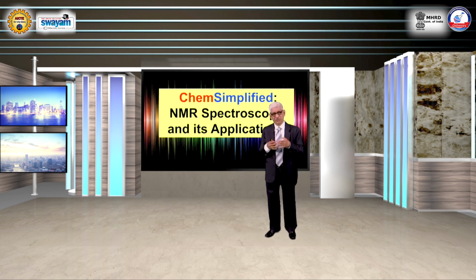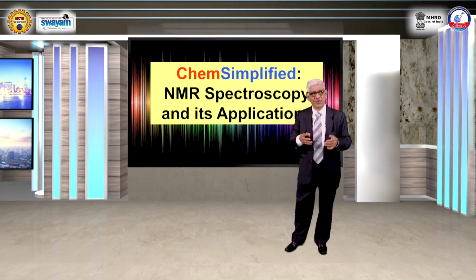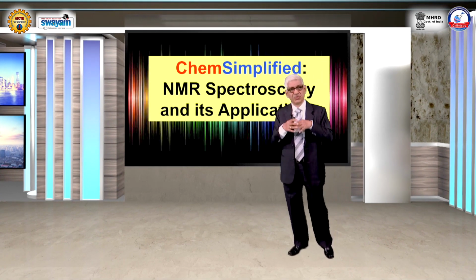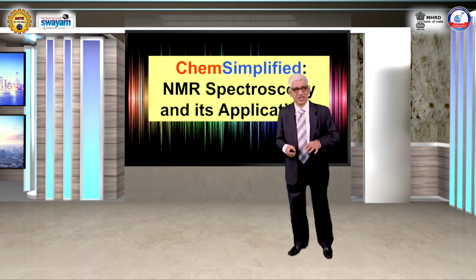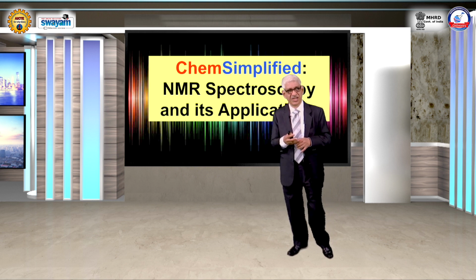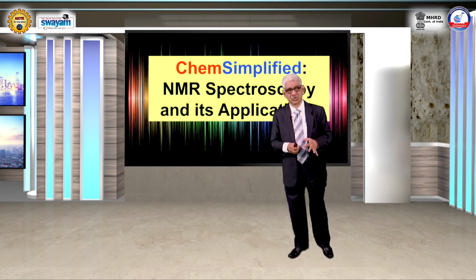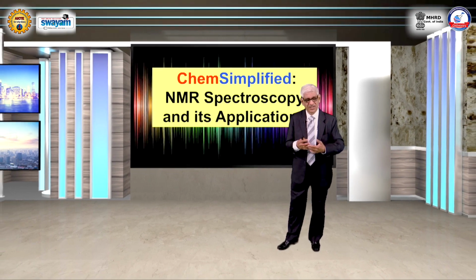And I showed you the fundamental developments with regard to the chemical shift, the coupling constants, and then also introduced you to how to measure these various spectra, earlier ways how they were used, and what was the revolution created by the Fourier transform NMR spectroscopy, how it resulted in time saving by orders of magnitude, and that made applications which were hitherto not possible. Especially spectra could be recorded at natural abundance of carbon 13 and nitrogen 15, and this laid the foundation for the development of two-dimensional NMR spectroscopy, and that was another major revolution which happened in the 1970s.